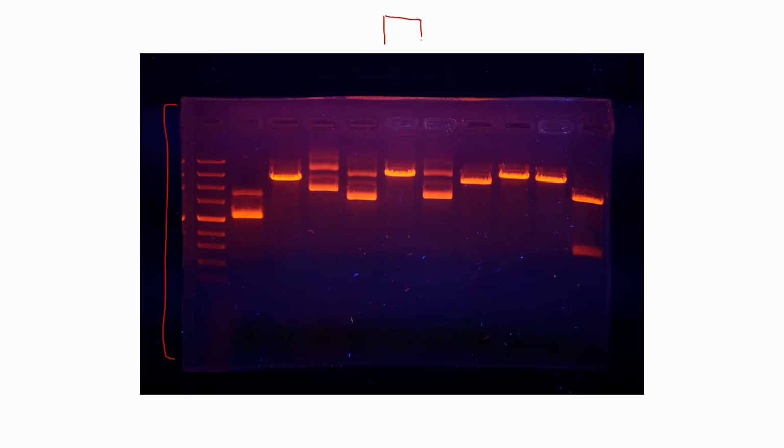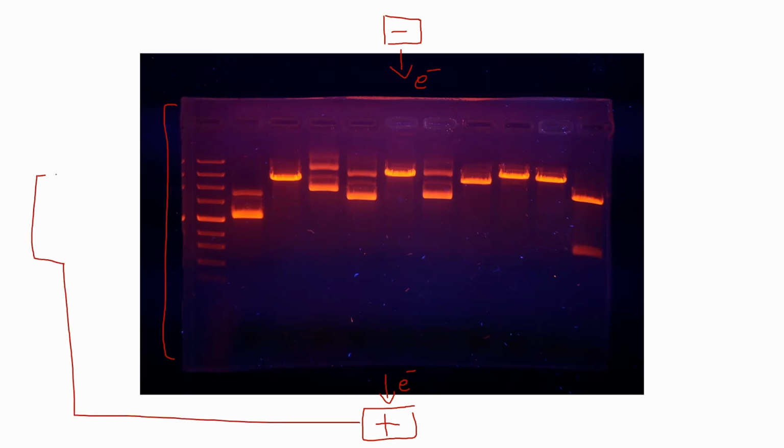So let's say that here you have a cathode, and on the bottom you have an anode, and the cathode and the anode are connected with a power supply. Obviously, electrons will move out of the cathode, and eventually they will move through the buffered solution into the anode, and this will produce a complete circuit, assuming that here, for example, is your power supply.